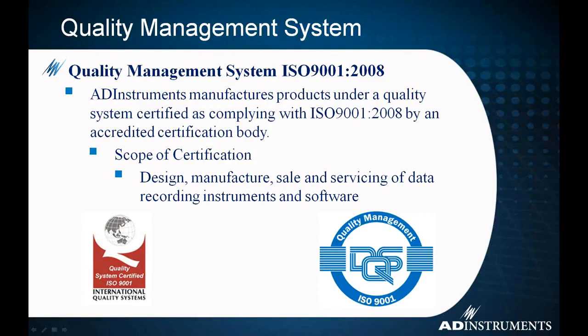Last but not least, quality management. More often than not, about once a month, I get a question from somebody who goes, well, how do I know what PowerLab is telling me and what LabChart is telling me? How do I know that's accurate?